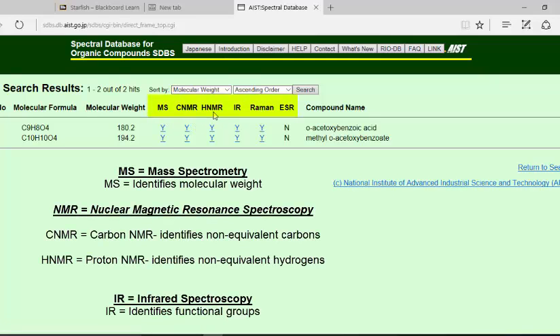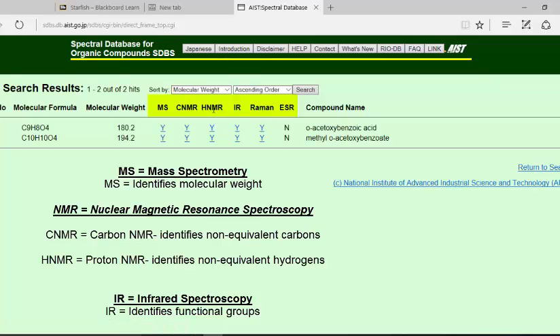Mass spec, carbon NMR, proton NMR, infrared, Raman and then electron scattering. What you want is the H NMR.